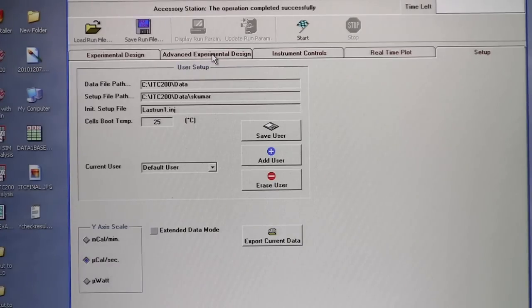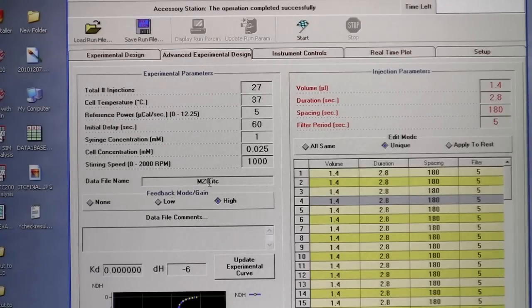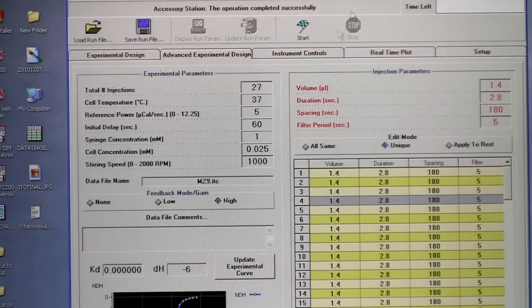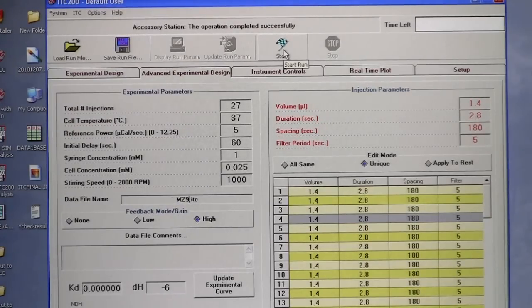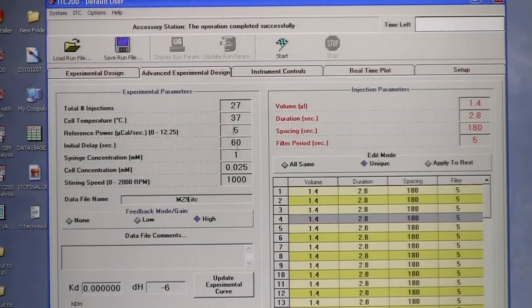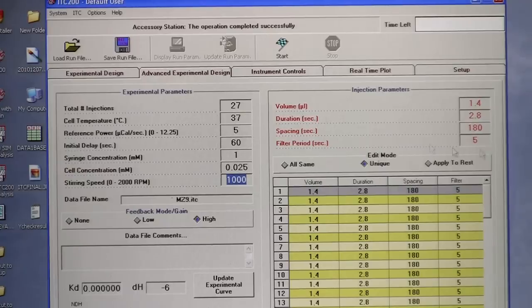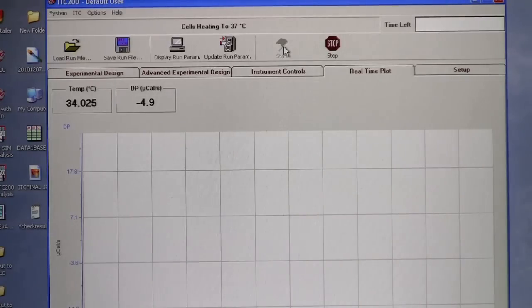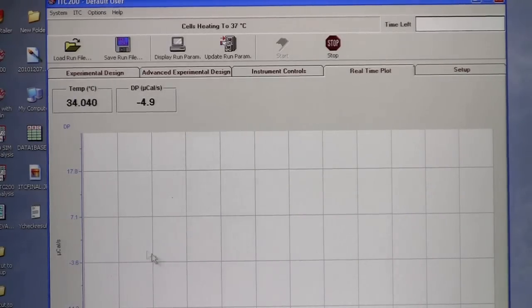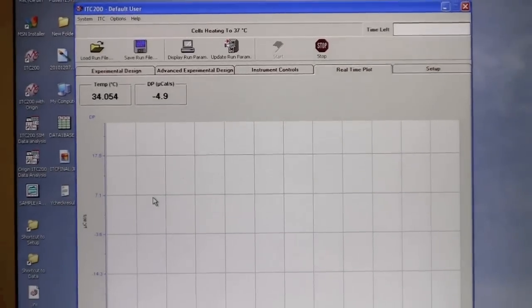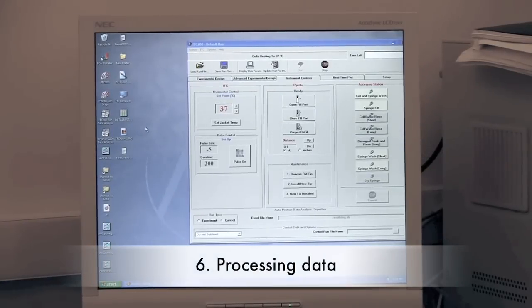Go back to Advanced Experimental Design and name your experiment. Before starting, double-check all parameters: number of injections, temperature, concentrations, and volume per injection. Once confirmed, start the experiment. The screen will change to show the real-time experiment as it runs.